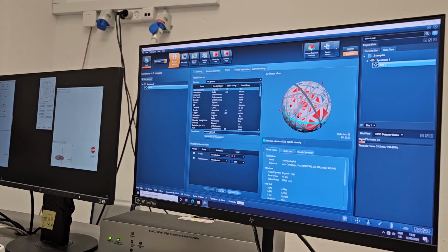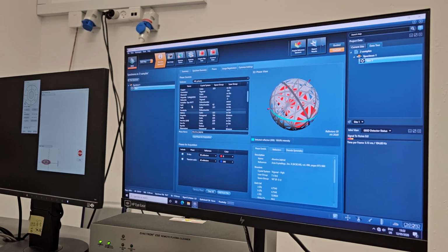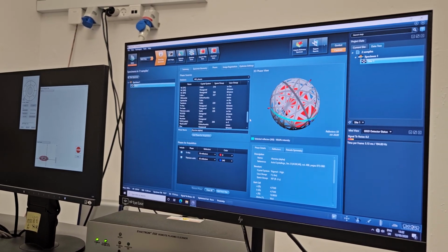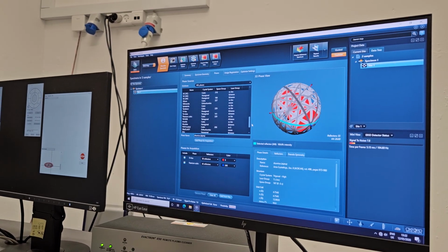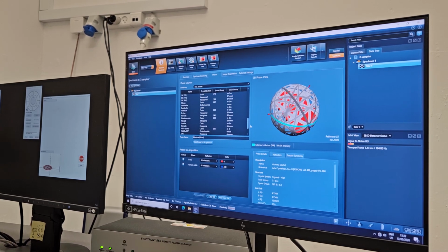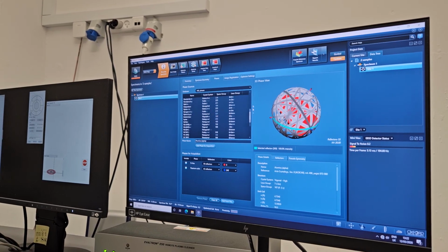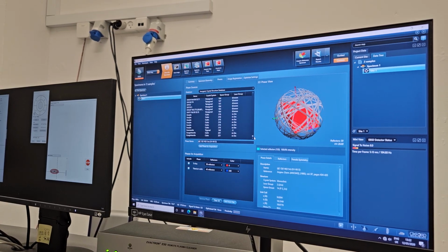What about, for example, if we want to choose some intermediate particles, like sigma phase? Then you need to know what the composition of this phase or the chemical formula is, and then how to add that. You will not find sigma phase here. You need to know the formula. Sigma is the name. And if you found the formula, how to add that one? Then you need to go through a zip file, kind of, from the other one, inorganic.